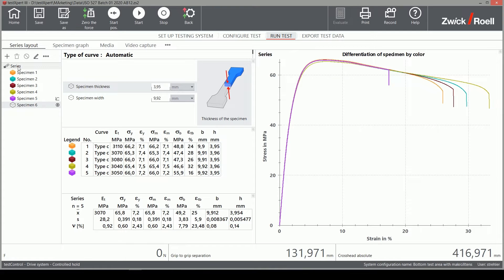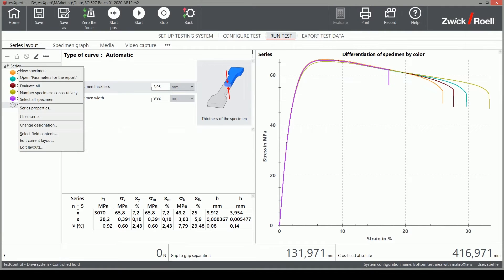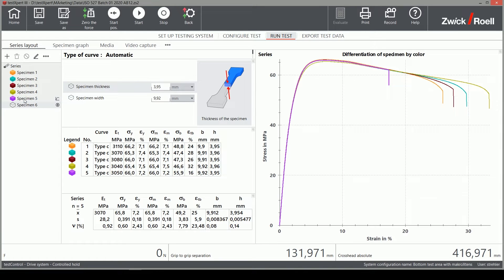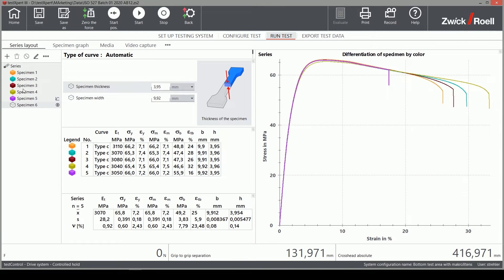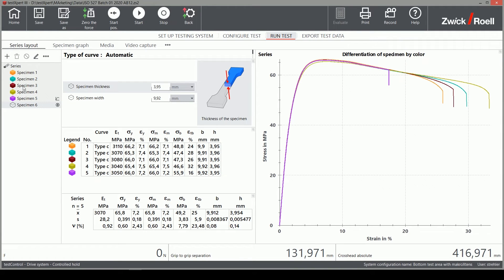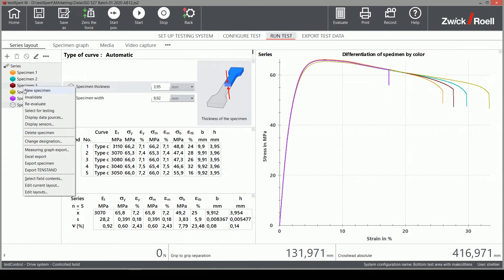First, I prepare the Excel file with all the data our lab manager needs. I select all samples from this series and just press the right mouse button and select Excel export.